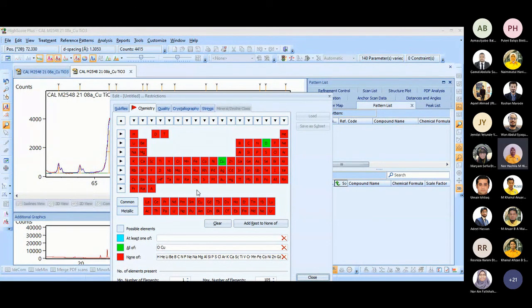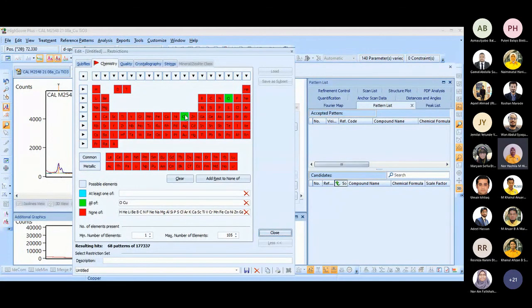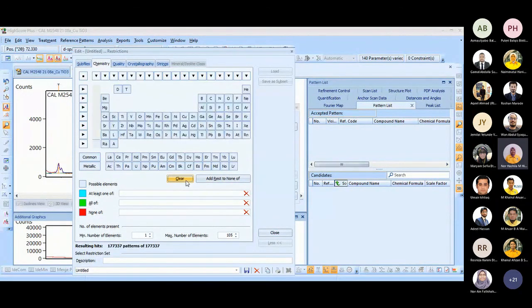Yes, Mariam. Identical means the blue and red peaks are similar, in terms of peak height, peak width, and peak intensity. Okay. All right. So you need to choose.